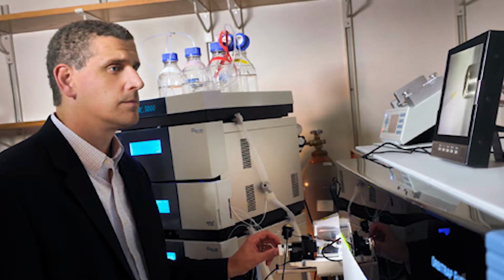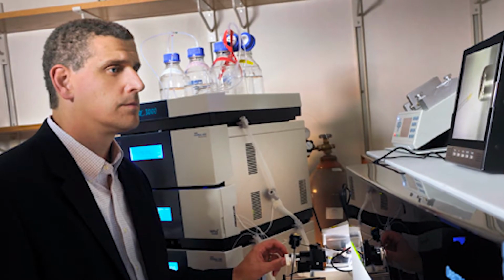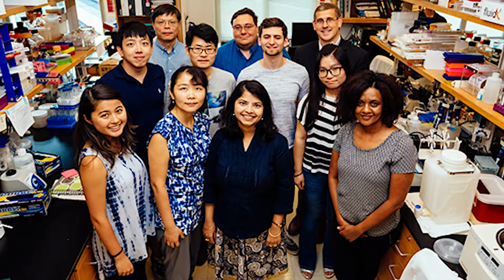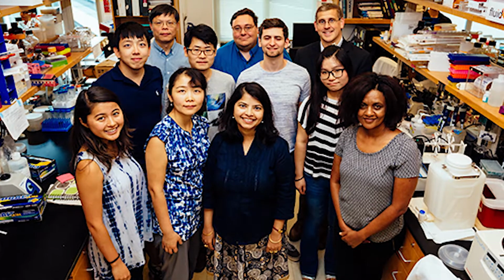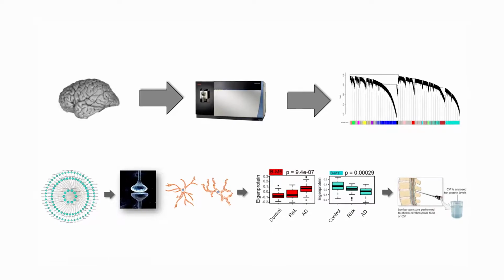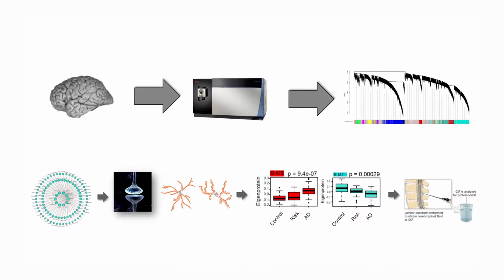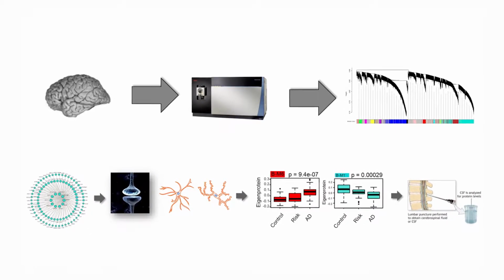My research is focused on the use of quantitative mass spectrometry techniques and proteomic technologies to characterize Alzheimer's disease and related neurodegenerative diseases, human brain tissues, and the modifications of the proteins within these tissues, and how these relate to disease pathogenesis. And then ultimately what we want to do is take the signatures out of the human brain and translate these into biomarkers for the early detection and diagnosis of Alzheimer's disease and related neurodegenerative diseases.